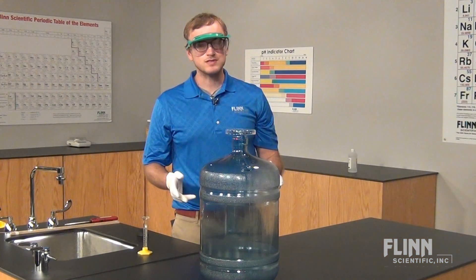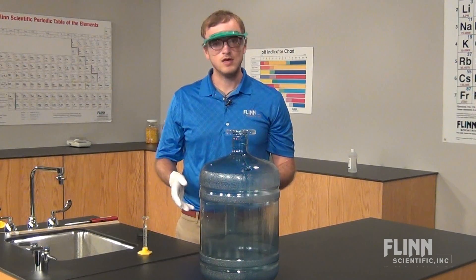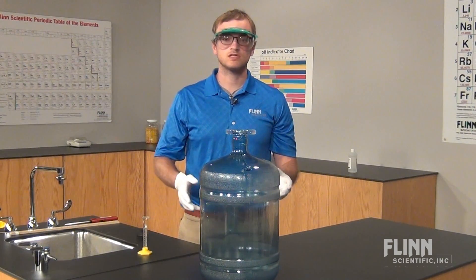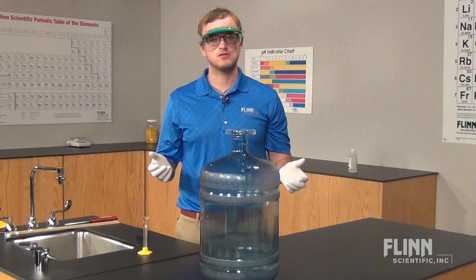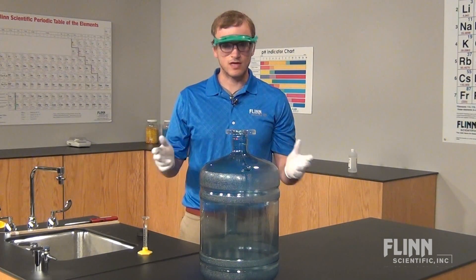Follow these simple steps to ensure your woosh bottle demonstration is both fun and safe. Please feel free to call with questions about this or any demonstration. We will happily help you to ensure a safe environment for you and your students.